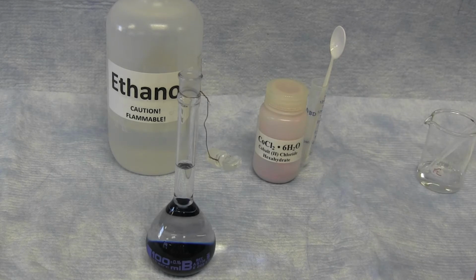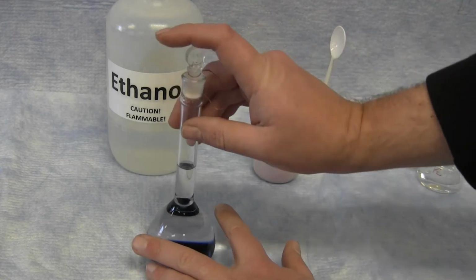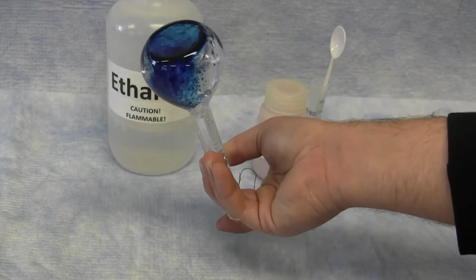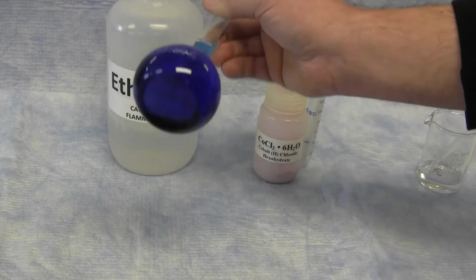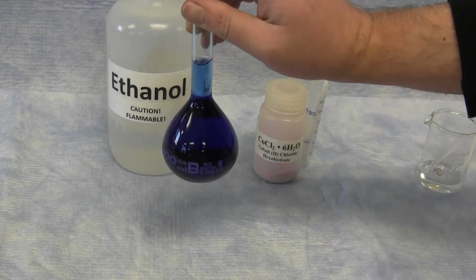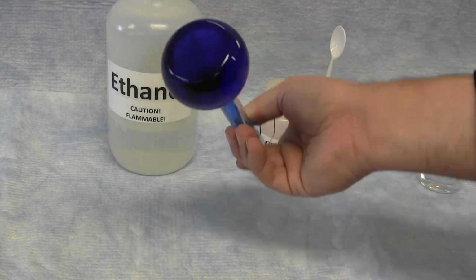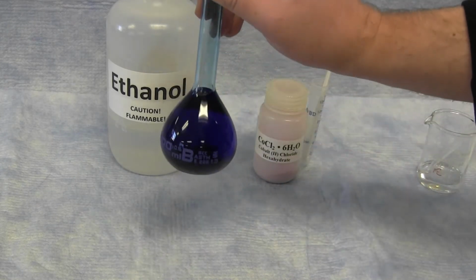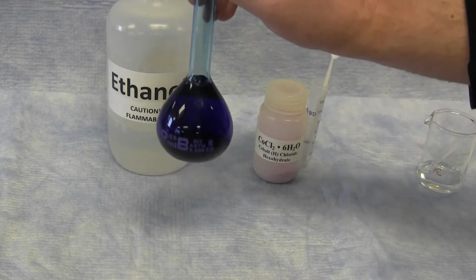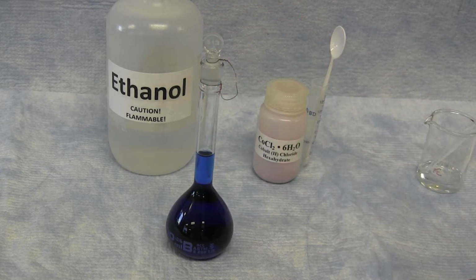When the volumetric flask is filled with ethanol, you can stopper the flask and invert the volumetric flask several times in order for the cobalt chloride to dissolve. Afterwards, you will have a 100 milliliter solution of cobalt chloride hexahydrate in ethanol, and you will use this solution throughout the rest of the experiment.